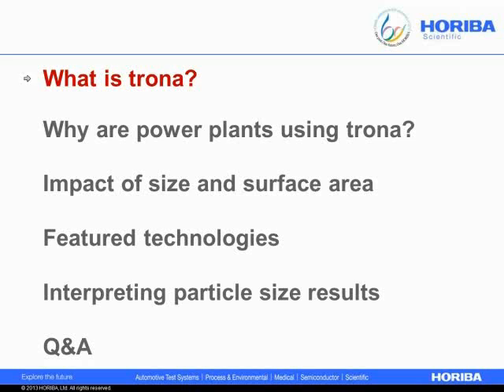And what we will talk about today is, first, I'm going to go over what is Trona, for those of you who don't know. Why are power plants using Trona? Trona has many different uses, but really where we've seen the most interest from the size measurement perspective is from power plants. The impact of particle size and surface area on Trona performance. We'll talk about the technologies that allow you to measure the size and surface area. And then I'll have several slides about how you interpret the particle size results before finishing off in the Q&A.